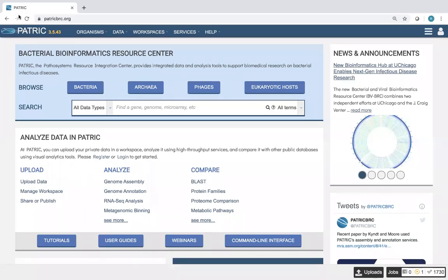One of the most common reasons for a phylogenetic tree job in PATRIC to fail is because the genomes that are selected don't share any genes or enough genes for the service to build an alignment and generate a tree. As the service takes a while to run, it might be useful to know ahead of time if my genomes are treatable. So in this little workflow that we're going to do today, I'm going to show you some ways that you can determine how and if your genomes are treatable.